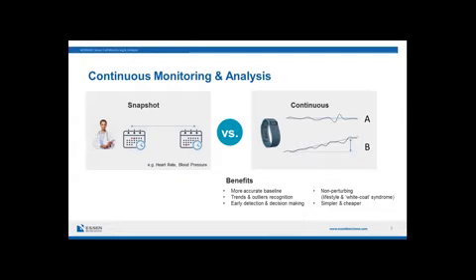Ultimately, this approach should be simpler and cheaper too. Now, I don't want anybody to take this as well, visits to your general practitioner are no longer required, but hopefully you get the point that the value of continuous monitoring provides something different and useful to these snapshot measurements.